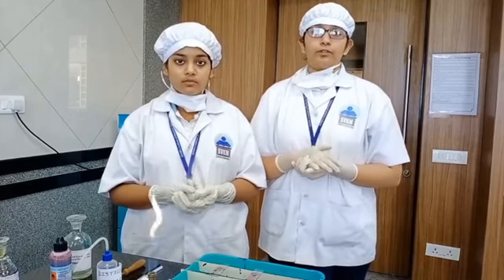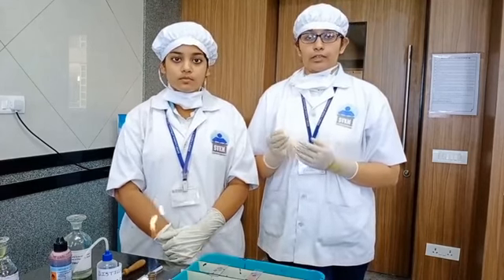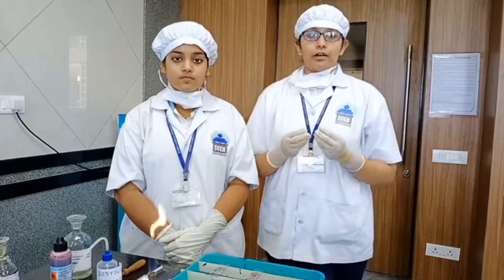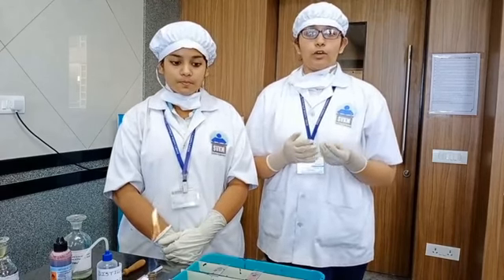The cell wall of gram positive bacteria contains a thick peptidoglycan layer, so it retains the crystal violet on the cell wall, and further addition of acetone or alcohol or safranin doesn't have any impact on it. So they will appear as purple or blue in color.